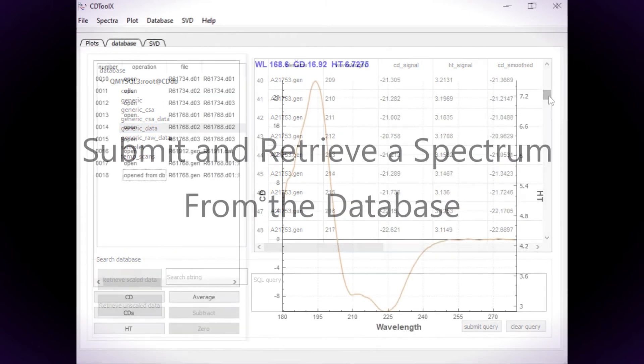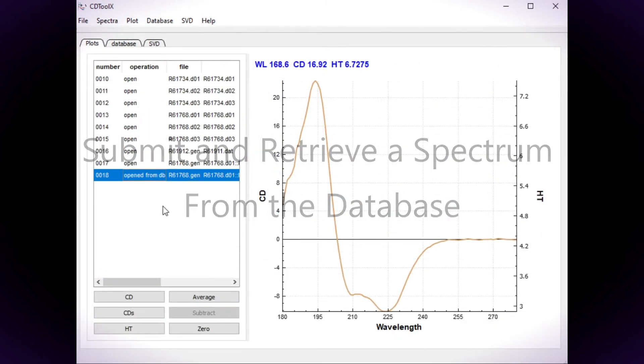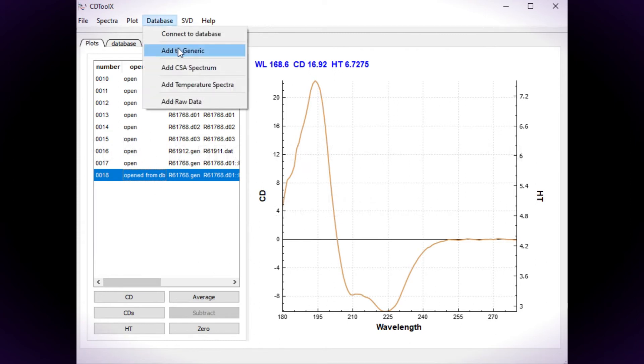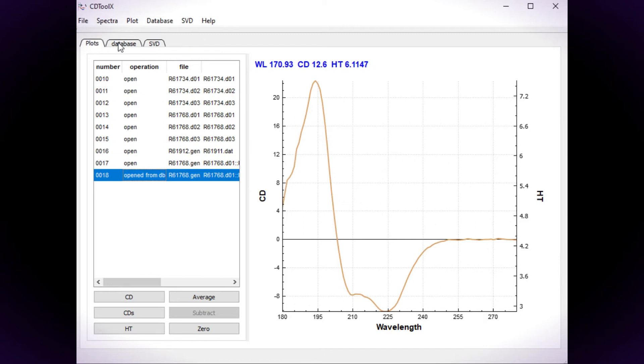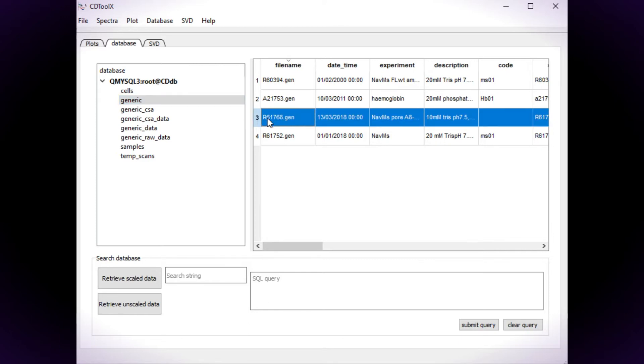To add a spectrum to the database, select the spectrum in the file list on the Plot tab. Choose Add to Generic from the database menu. When the table is refreshed, the spectrum will be listed.